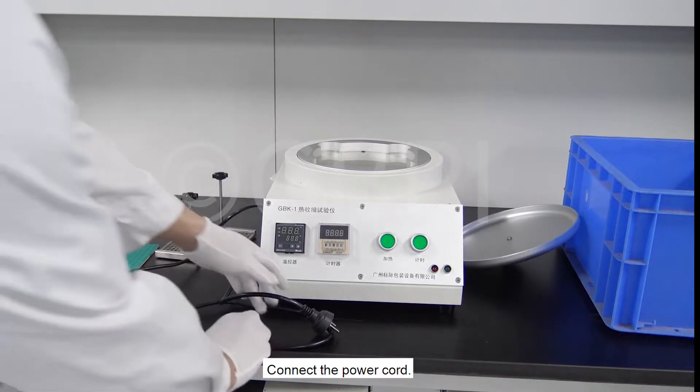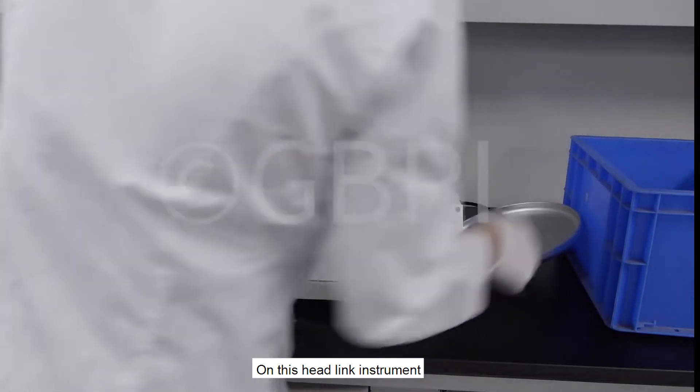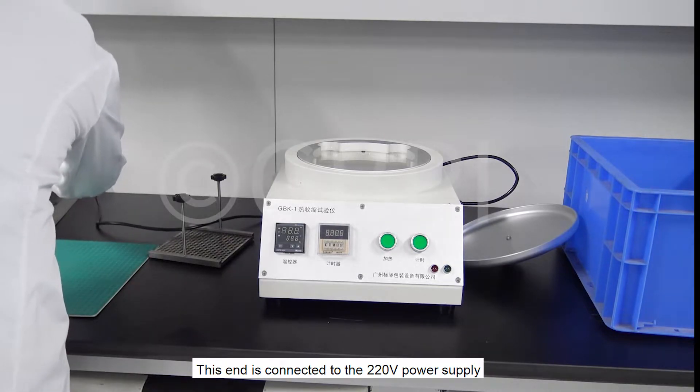Connect the power cord on this instrument. This end is connected to the 220-volt power supply.